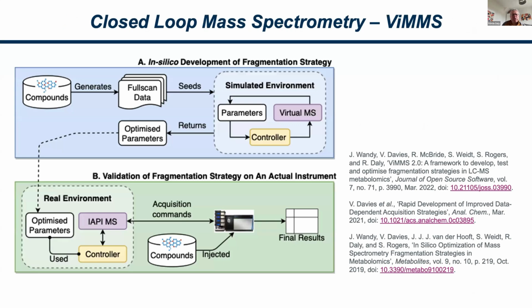And finally, one of the big tools we had developed quite a while ago was the idea of being able to help the understanding of metabolomics type data by designing this in silico mass spectrometer. The idea was that we were able to design a system that would increase the number of fragmentations that we were getting in our mass spectrometry LCMS system, and by doing so, get better identifications of the metabolites that were coming out of experiments.